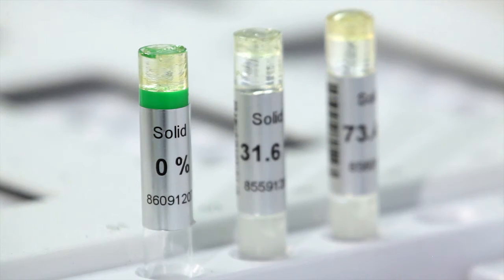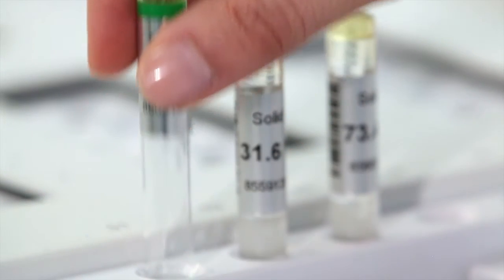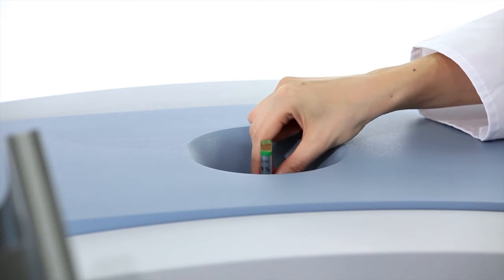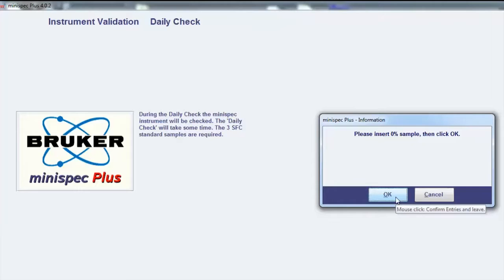The system is pre-calibrated and upon installation the system is validated with three Bruker certified standards. Once a day, the standards are measured to validate the system.